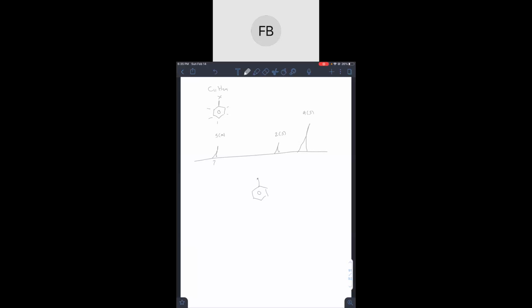So we actually have quite a few more carbons to go, right? So 11 minus 7, or let's just say minus 6. So 11 minus 6, so that tells us that there is 5 more carbons that need to be added on here. And at this point, I usually just go on the side and start figuring out the functional group separately.